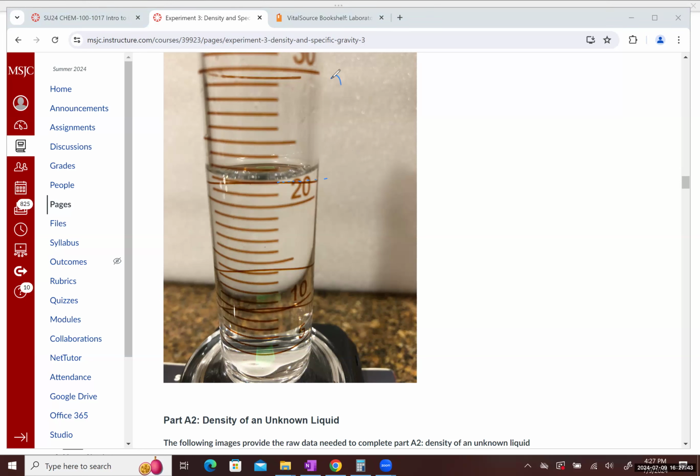So just as a check, to go 10 milliliters, it takes us 1, 2, 3, 4, 5, 6, 7, 8, 9, 10. It takes us 10 tick marks. Thus, 1 tick mark, each of those little graduated marks, corresponds to a milliliter. And we know that 1/10 of a tick corresponds to 1/10 of a milliliter, which is 0.1 milliliters.